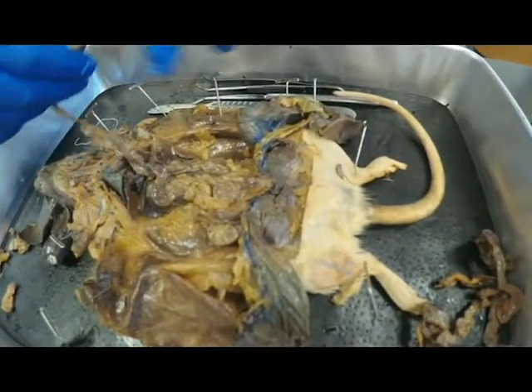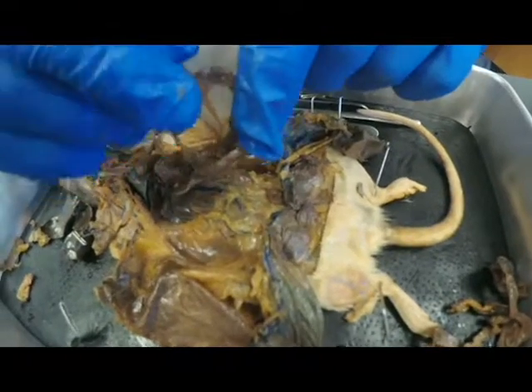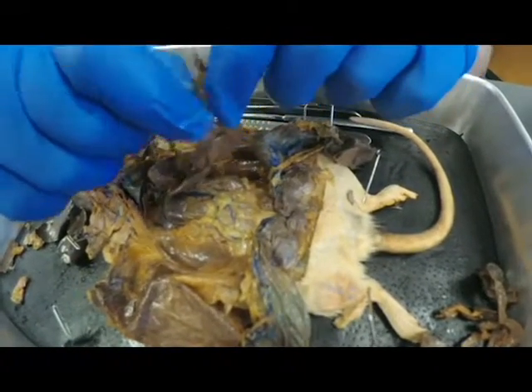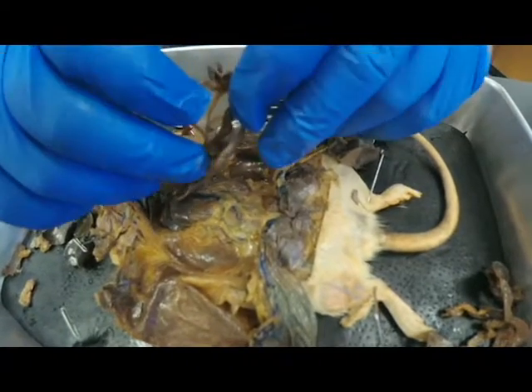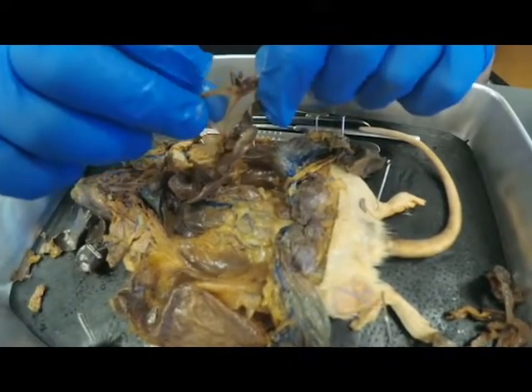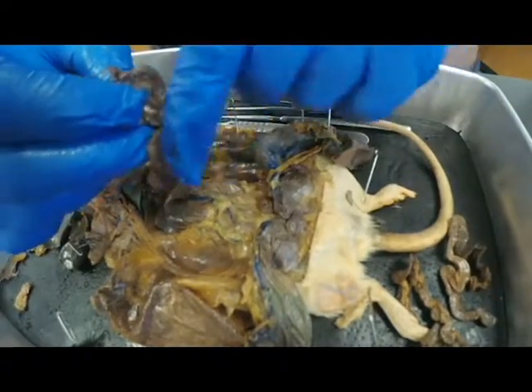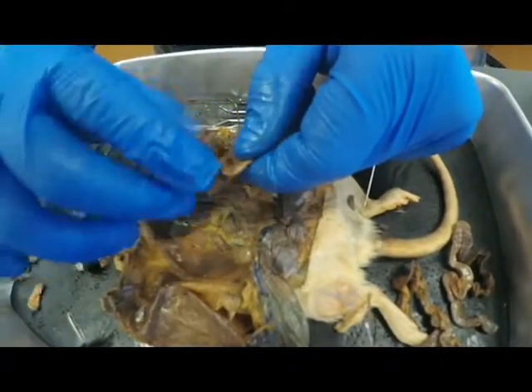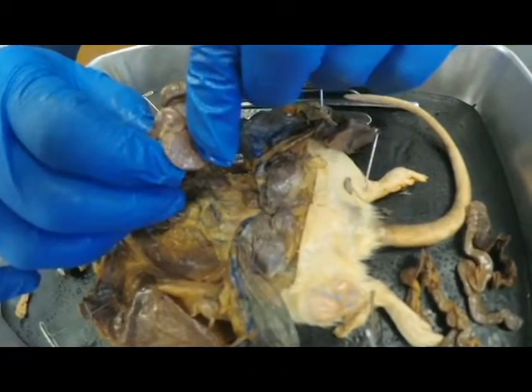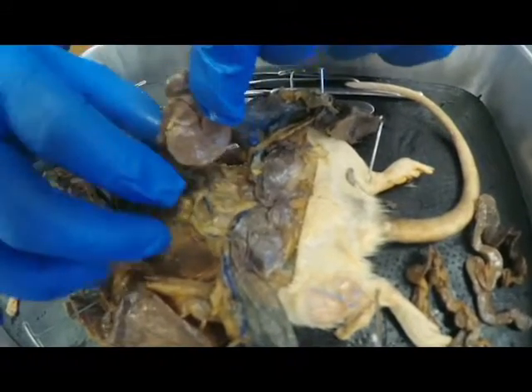So the continuation of the small intestines is right here, and it has this webbed, veined material, and that is the membrane that connects them. It consists of a lot of blood vessels. They both nourish the intestines with blood, and they receive the nutrients from the food that's being digested. So whenever we cut out all of the small intestines, that's what was connecting all of them together. Now, the small intestines goes into the cecum. The cecum is something that humans don't necessarily have. Humans have an appendix, which is a much smaller type of cecum, and it connects the small intestines to the large intestines.